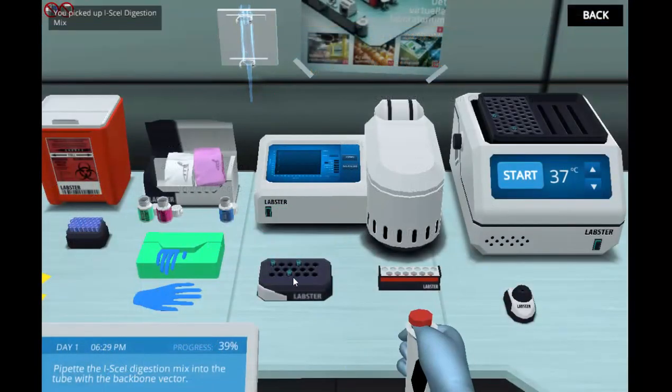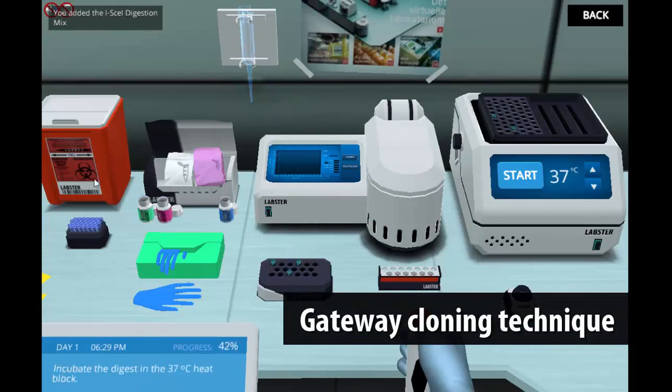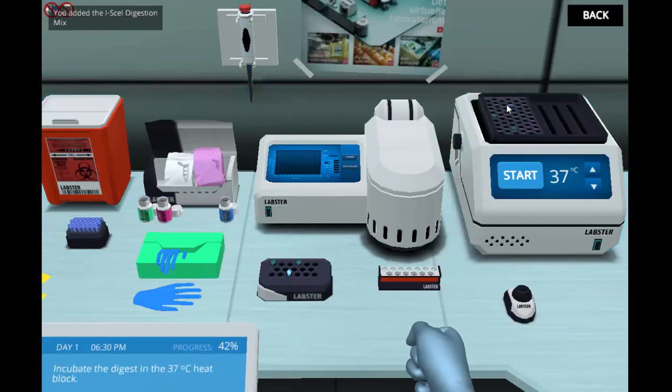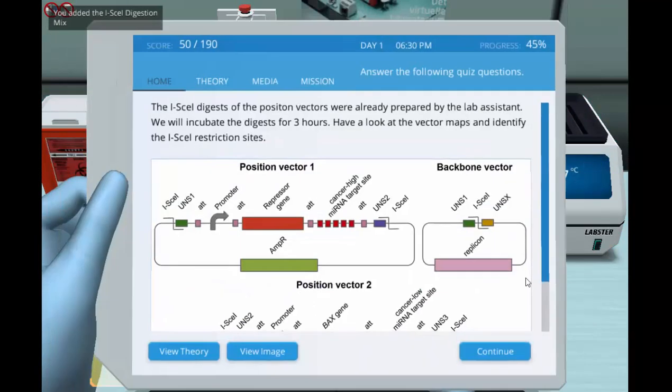The circuit parts are combined with the gateway cloning technique to produce position vectors that will guide the insertion of the circuit parts into the final circuit.